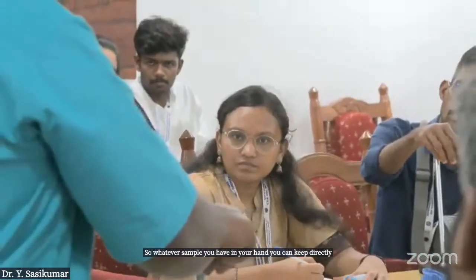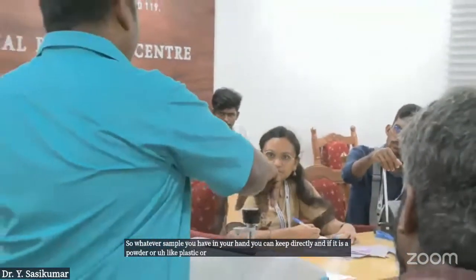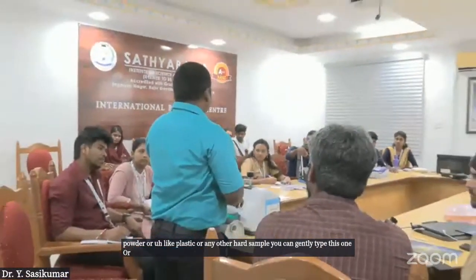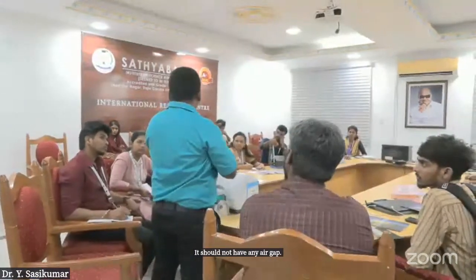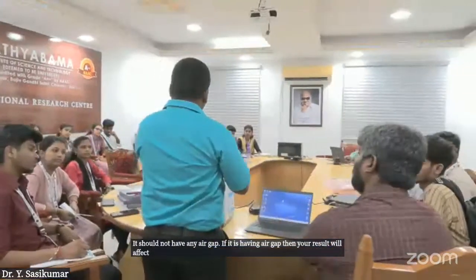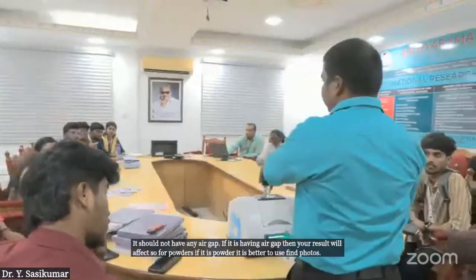If it is a powder or plastic or any other hard sample, you can gently tighten this. Why? Because whatever sample you keep over here should not have any air gap. If it has an air gap, then your result will be affected. If it is powder, it is better to use fine powders rather than granules.